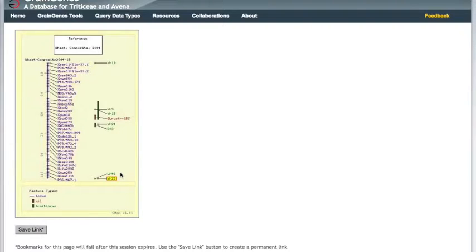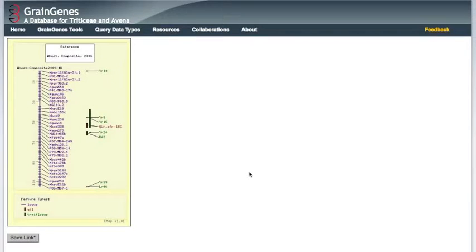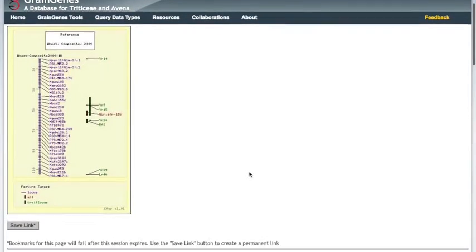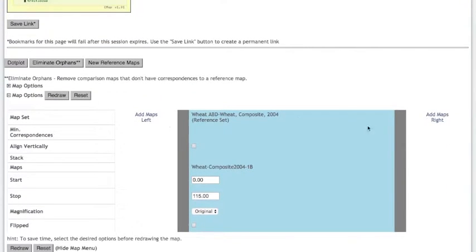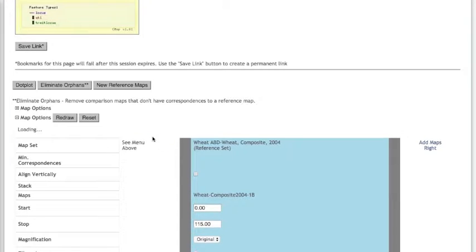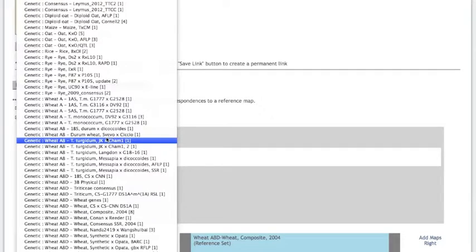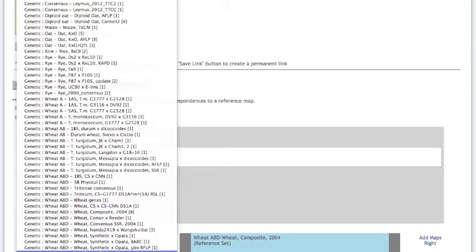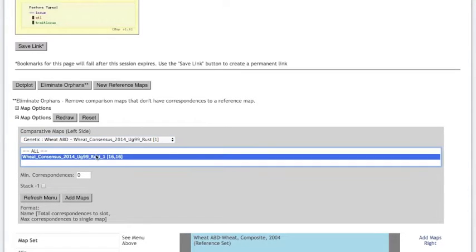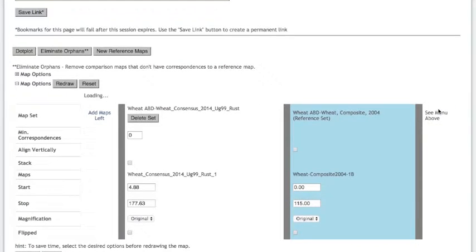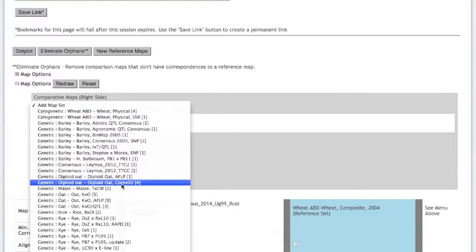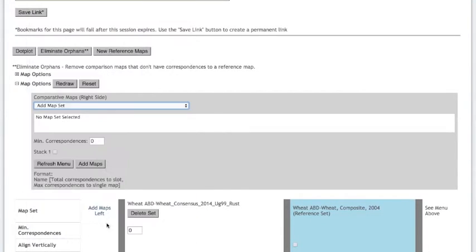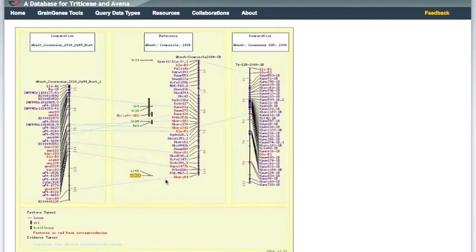On the locus report, YR29 was only listed on one map. With cmap, however, we can compare maps to see if any markers near YR29 are also in other maps. I'm going to choose two maps for comparison. Scrolling down, you can choose to add maps on either the left or the right. We are then prompted to choose a map set and a specific map to draw. I'm going to choose a hexaploid wheat UG99 consensus map on the left and the consensus SSR map on the right.